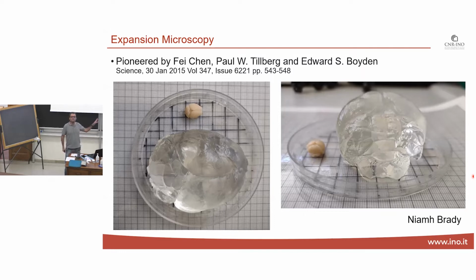Of course, with these samples this big, we usually look at a smaller portion in the sample. Otherwise, the numbers that I gave you at the beginning are referred to this volume. Imagine, so this volume that is 10 times, one order of magnitude bigger. Yes?